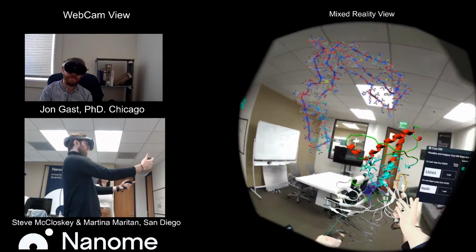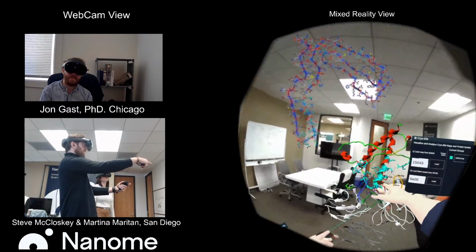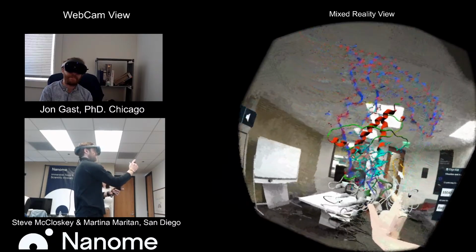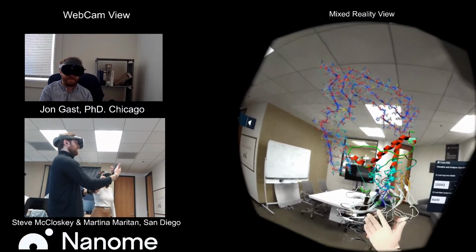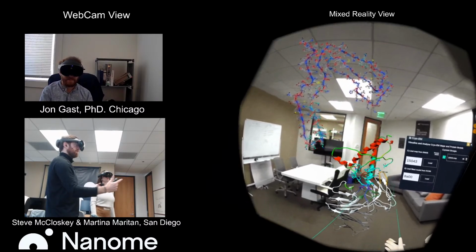So it's more difficult, once this is freely floating around, we get it bound with the antibody. Now it can't really join its other sister proteins and form more of a plaque. We've been able to sequester that to prevent the amalgamation and buildup of an ever larger plaque.